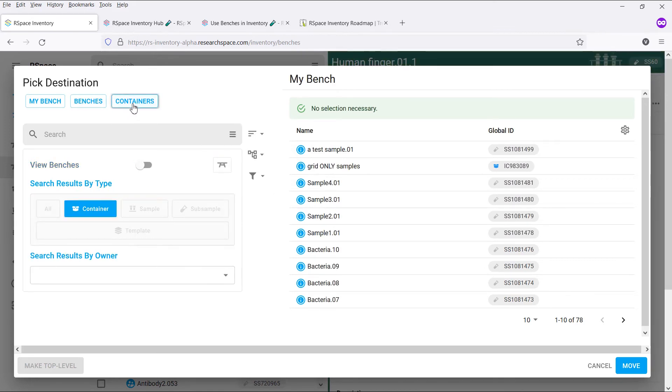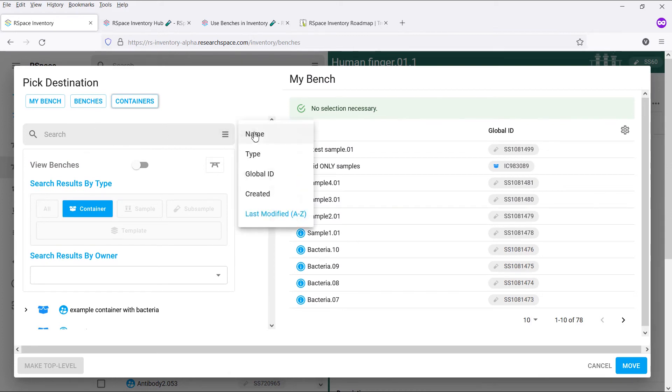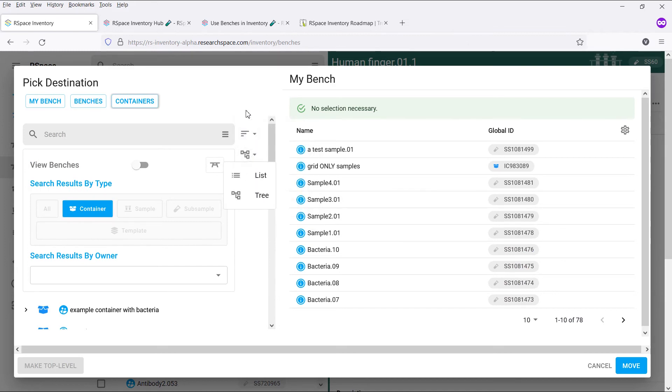You might notice that we have completely revamped the move dialog so that it provides all of the neat features of our main navigation system. You can search for containers, sort them, change between list and tree view, and filter by just mine.